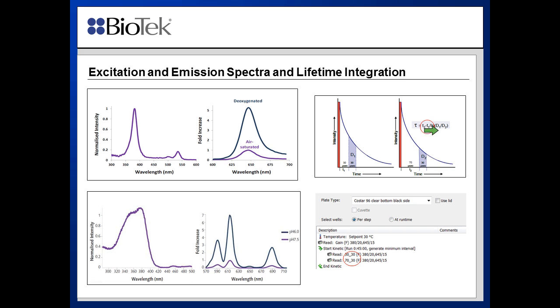The other thing I want to point out here is the lifetime measurement. That's actually an equation that takes the ratio under the curve of the fluorescent probe decay, and you can measure at these 2 different time-resolved steps. We did everything at 30/70, and this is explained more in the application note. But you can also edit these. They can be 40/60. You can try 20/80, and either way, you may be able to gain some sensitivity on the assay.